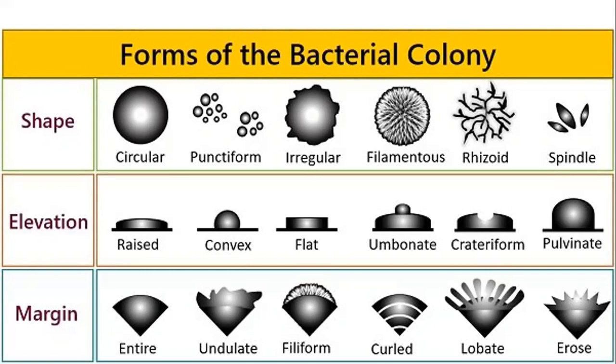If you are studying morphology, a front plate is mostly recommended. Take the picture from the front plate; once the picture is taken, everything is done. Now remove the seal and open the plate for gram staining.